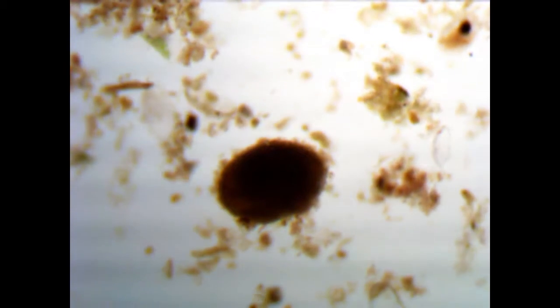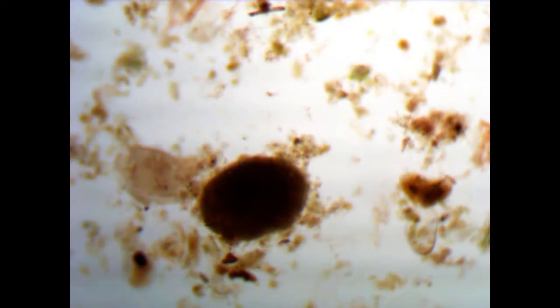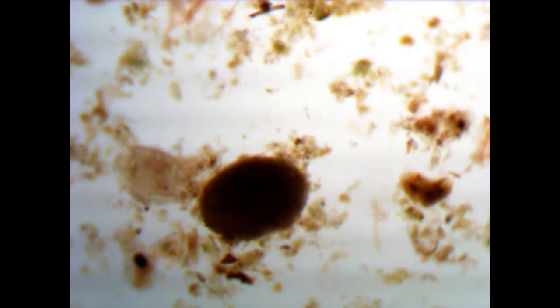Speaking of things that are on my plate, this is the time when I decide enough is enough. I'm going to isolate this interesting organism from my microscope. Again, I must apologize. I do not have the adequate equipment to be going around. Oh, that might have been a shrimp egg, but I'm not quite sure. It was very difficult to see inside them. They were very opaque. And of course, the toothpick is a somewhat crude instrument to utilize. I think I might have damaged some of my specimens this way, but I'm getting better at it.